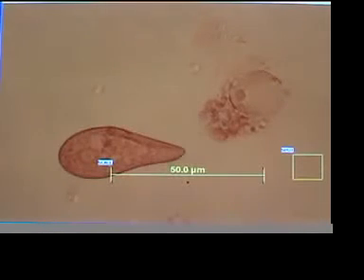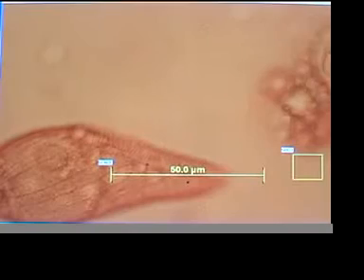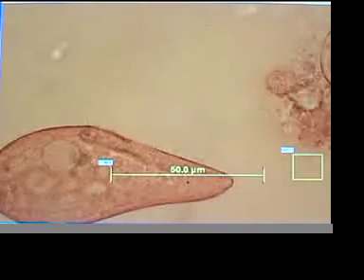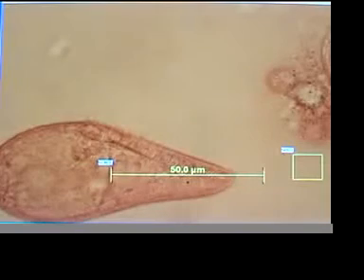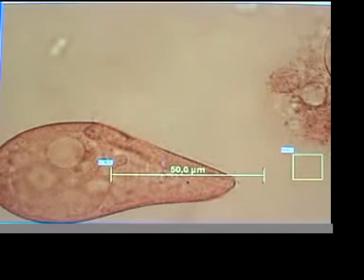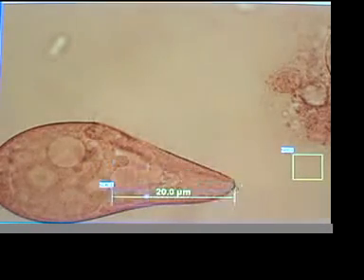And let's take a chance and go up a notch here on the microscope slide, or microscope. Take a little closer look at these guys. Now that scale is wrong. Let me fix that scale. We're on the 20x objective.